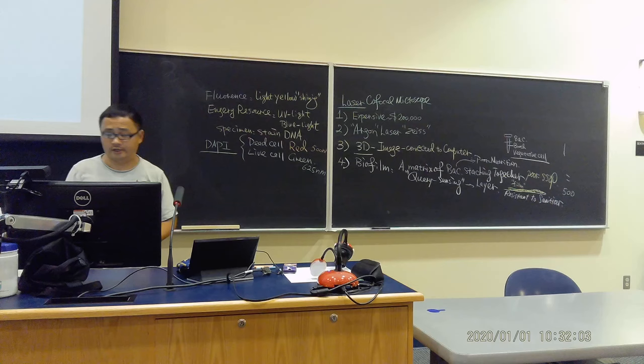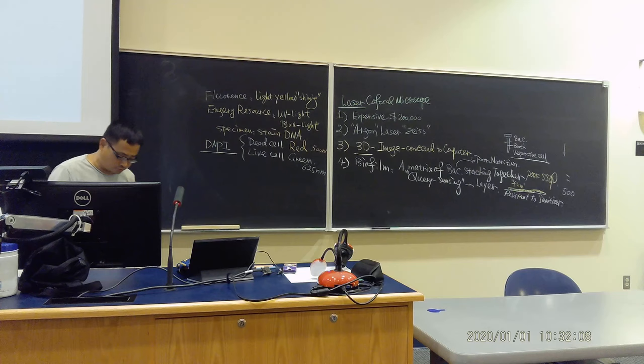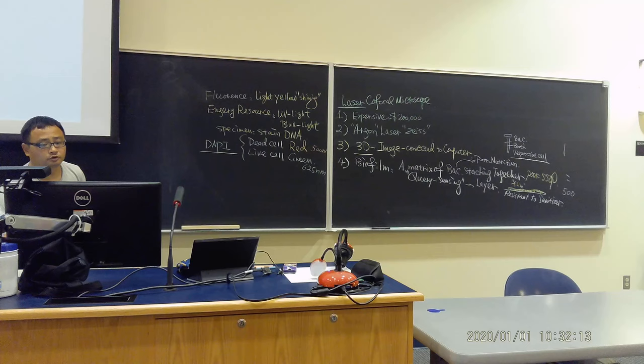And I didn't do the 3D images, but I can just show you something there. A is a normal bacteria, which is like a control. And we stain it for DNA. We're using this stuff. And this is the color spectrum. The right side x-axis is green color. The y-axis is red. So you see most of them are green, which means the control, lots of them are still alive. So the color spectrum feature is on the right side.